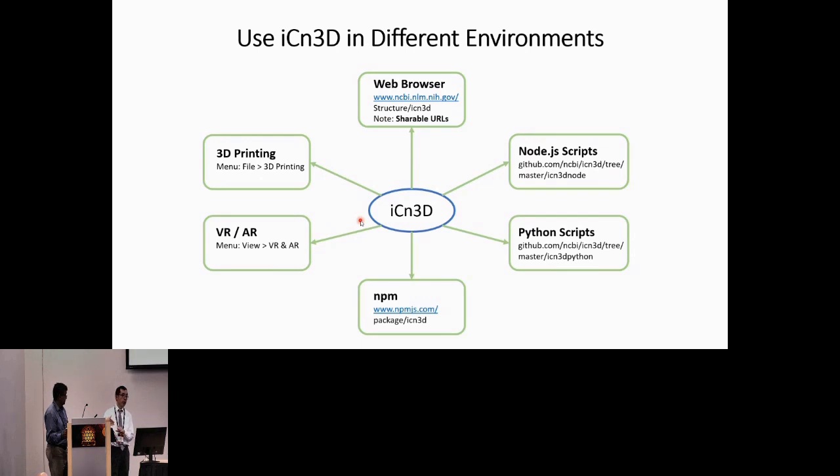So it integrates annotations from NCBI, from EBI, and in the near future, we also try to add more information to the interaction analysis for chemicals, so we can show the chemicals as a 2D diagram and show the interactions for each atom at the atom level. I think that's actually done in the EBI, but we would like to do something similar in iCn3D as well.